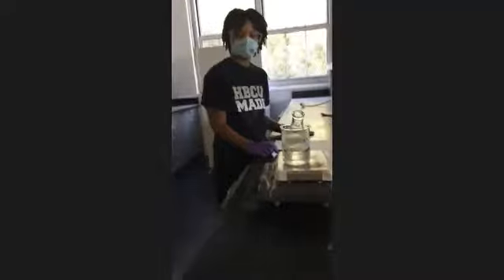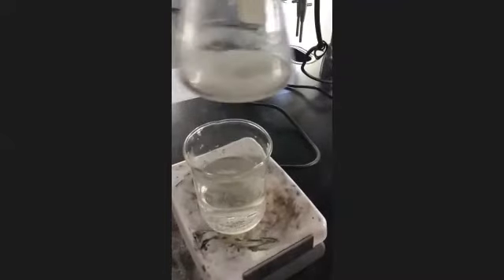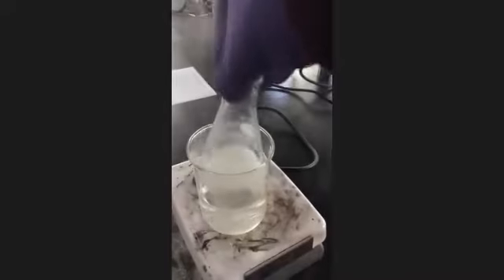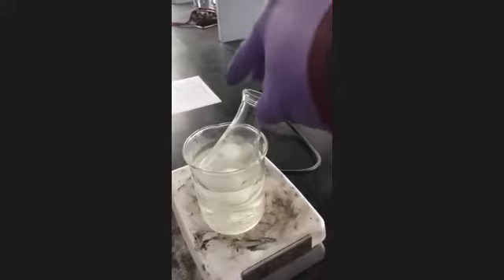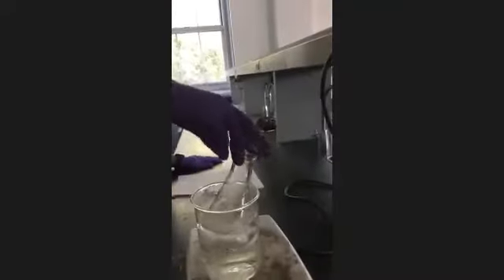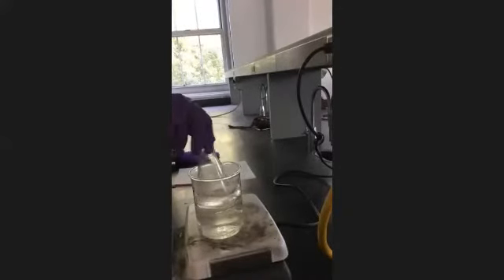So let me show you. Let me zoom in. You can see right now it's not clear. It's cloudy. But the longer you heat it, the more the reaction is going to go. So we're going to leave it in the water bath, and all you got to do is swirl it every now and then to keep it mixed. I'm going to keep the camera right there, and I'm coming around to the other groups.